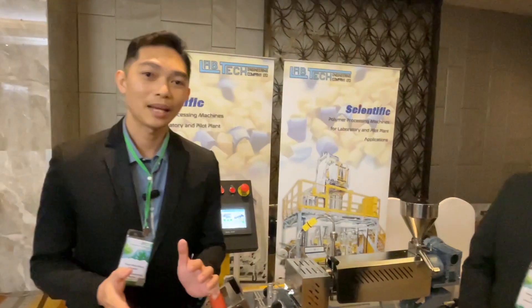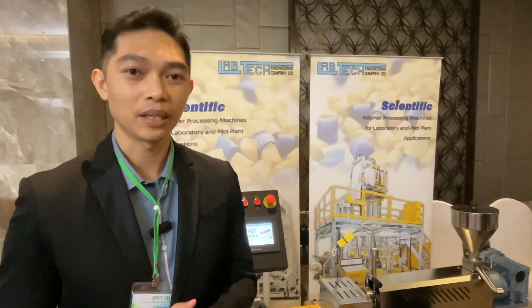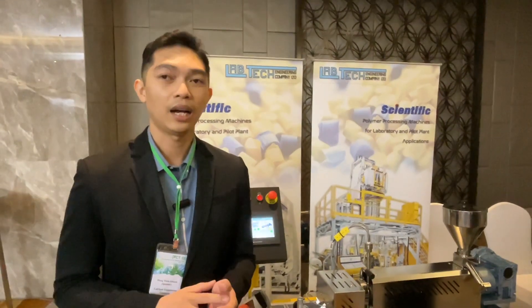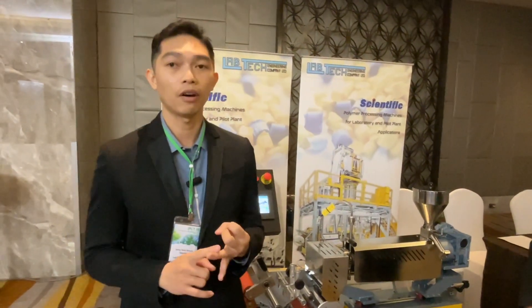Labtech is a global company in terms of processing machines for not only lab scale, but also for the pilot scale. We produce a lot of machines to make compounding, film, and also for filament.